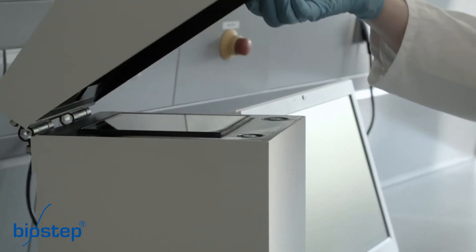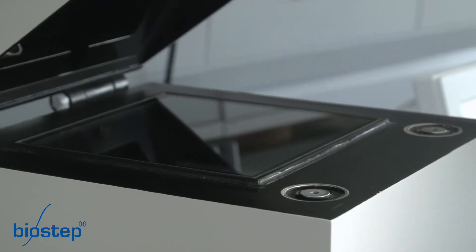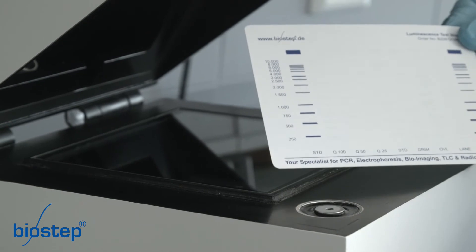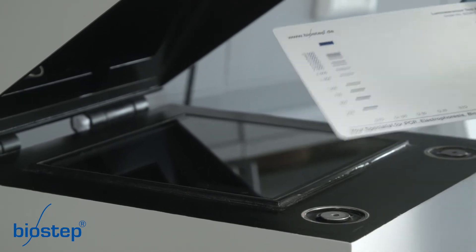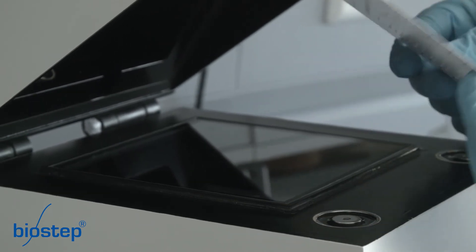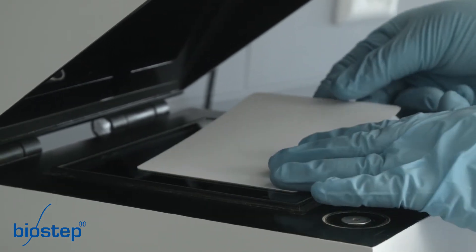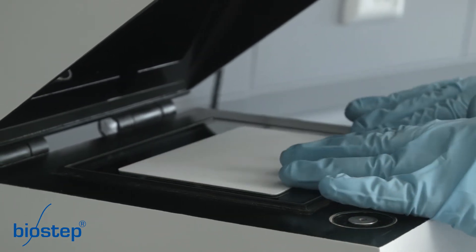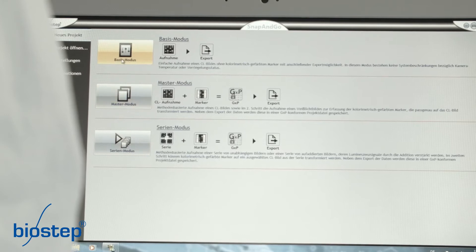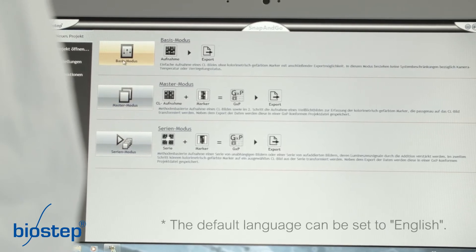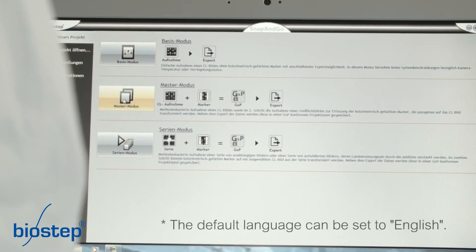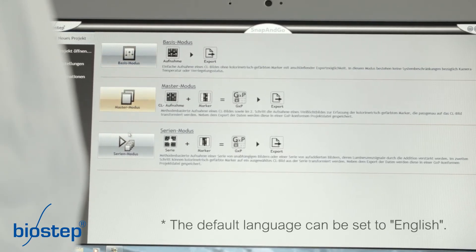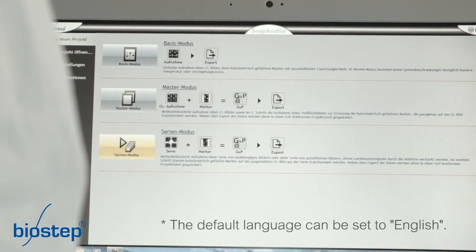This is a test blot for demonstrating the function of Kelvin. The software Snap&Go offers three working modes: basic mode, master mode and serial mode.